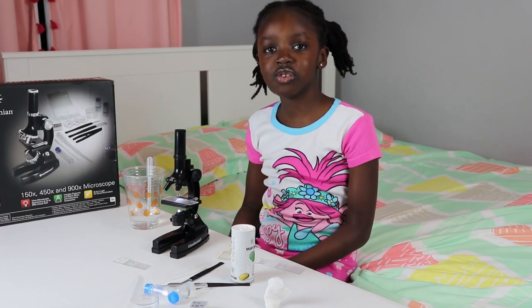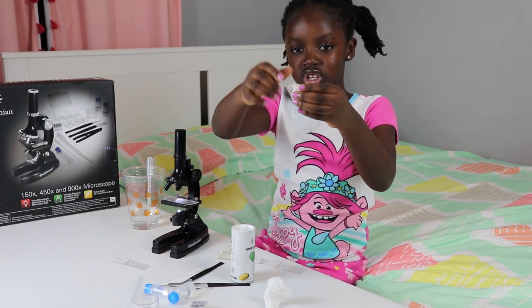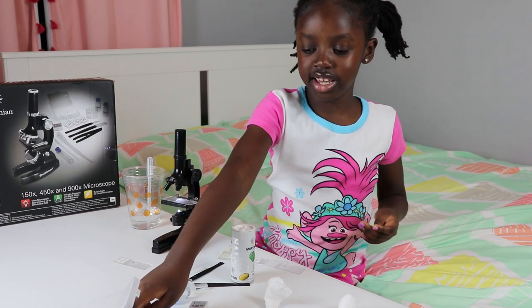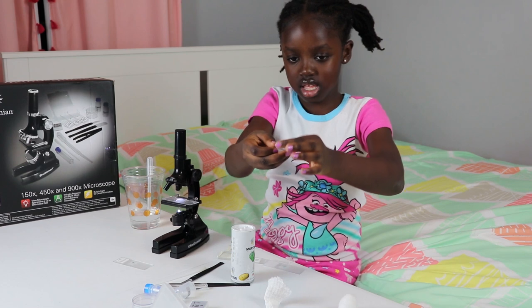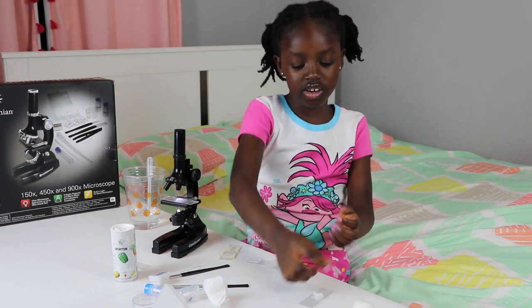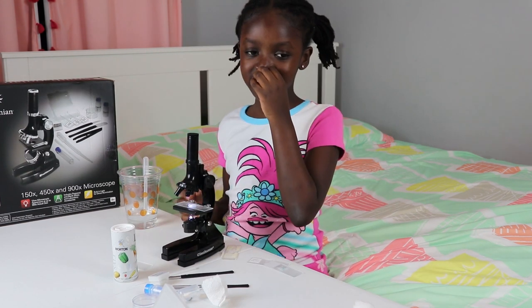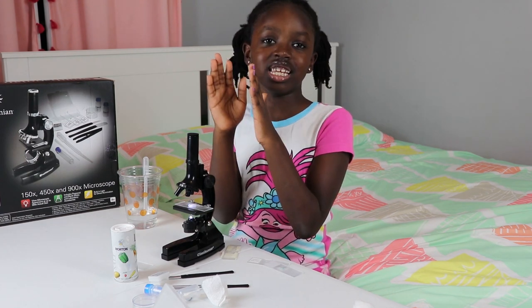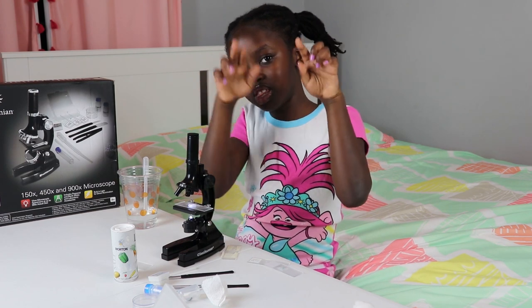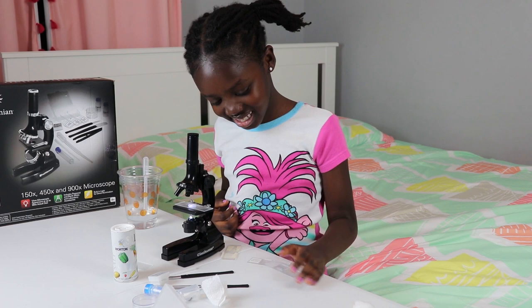So now I'm going to observe the cotton ball — I'm going to make a new slide. First I tear a piece of the cotton ball and make it flat. You get a blank slide and put it on. Then I get a plastic slide cover and put it on. It looks like hair going in all directions, filling the whole thing but not really filling the whole entire thing. There are a bit of holes that are gray. It looks like a hair fence — a hair gate, or something.